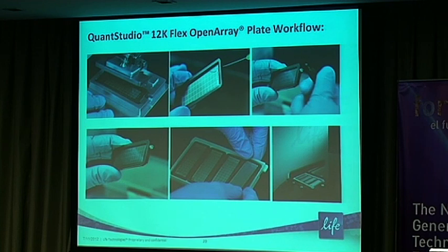The answer is no, because a thermal transfer going across the glass to the oil into the stainless steel array just takes longer, so the cycling times are a little bit longer. Not much longer. For gene expression runs, our cycling is about 2 hours and 10 minutes, so it's still not really that long. For genotyping, we like to actually go a little bit further, optimize our protocols for 4 hours for genotyping runs.